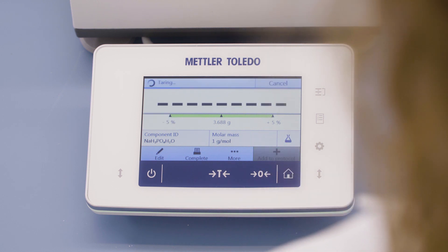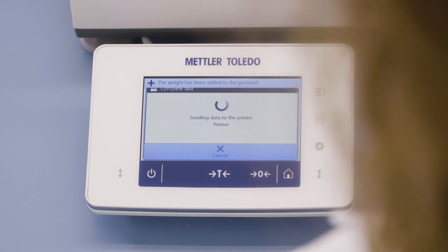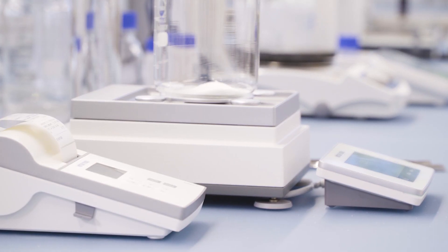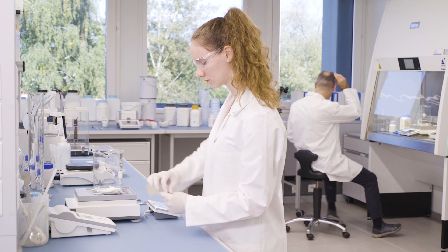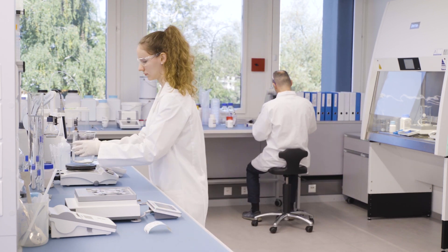Each weight result can be saved directly to the built-in results protocol. All relevant metadata such as time, date, user ID, and instrument status are included. Once all the ingredients are added, the weight results can be printed or exported to a computer.